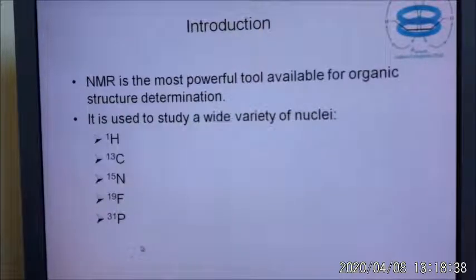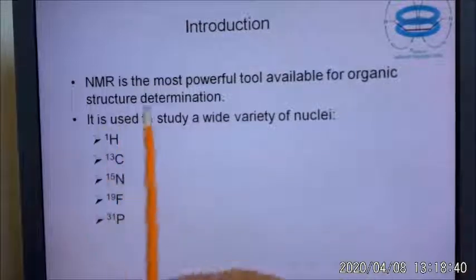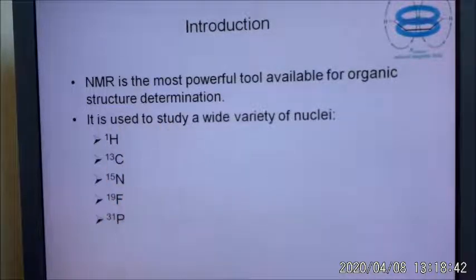Okay, there we go. All right, so with NMR, you can use a lot of different nuclei. We talk a lot about proton today. We'll be talking about carbon-13 today. We do N15, so if you like NMR and you want to do peptide and protein structure, we'll be doing a lot of N15. We also use fluorine-19 and phosphorus-31. This is really useful if you like to do nucleotides, and you're looking at RNA and DNA.